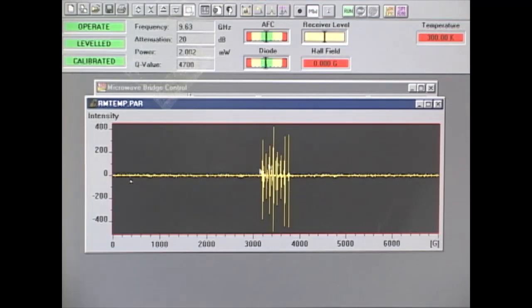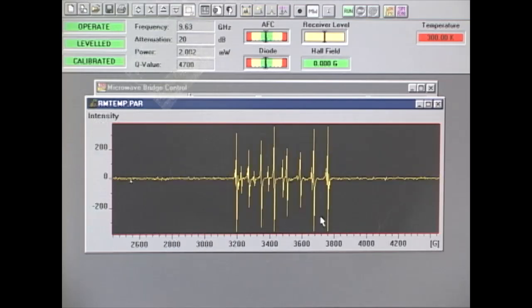What we have here is our actual signal. The signal intensity is very low. We can zoom in by drawing a box with the mouse to get a better picture of the signal.